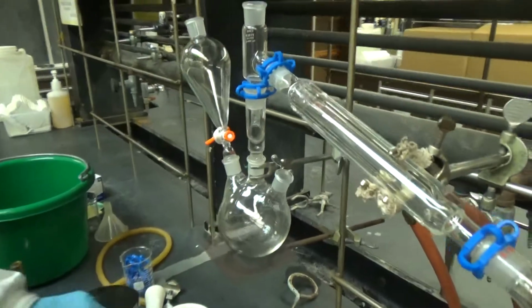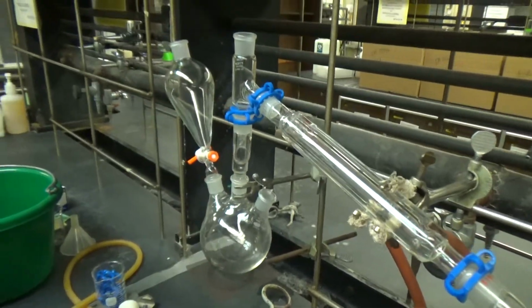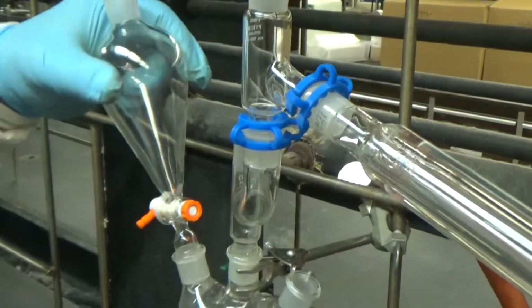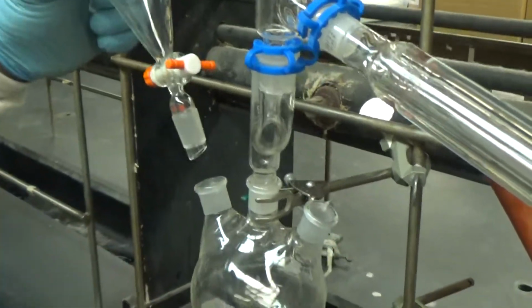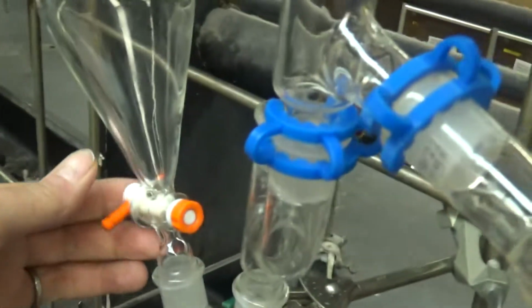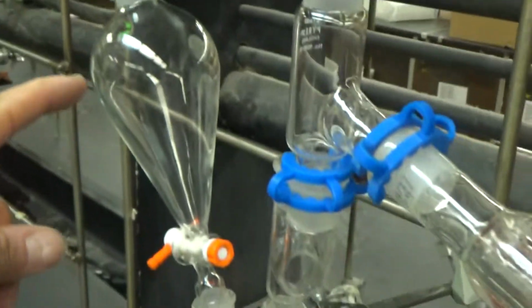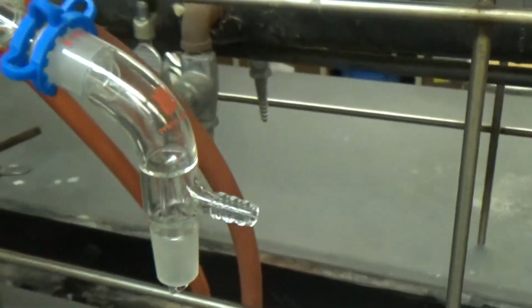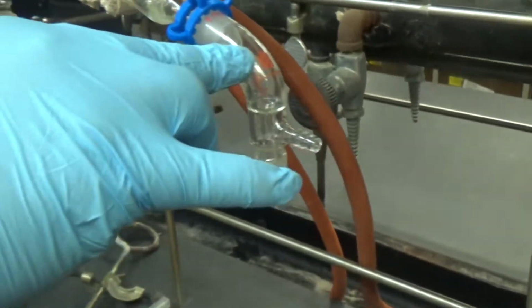Alright, so we just added the separatory funnel. Make sure that this one is outside, with the little joint like that, so that you can control it on the outside. And then you got the distilling head. That's a vacuum adapter. Distilling head's there.